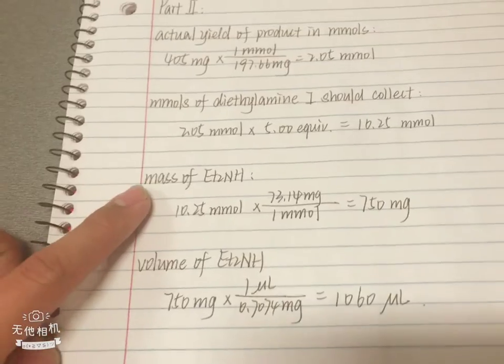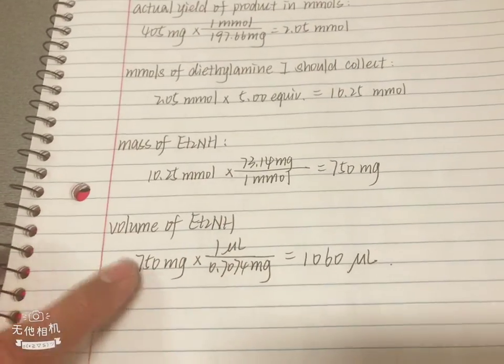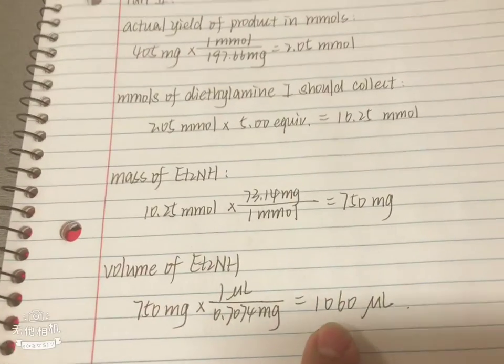Then we got a mass of it by applying the molar mass, and then we got a volume, which should be 1060 microliters. And in part 2, during the refluxing for 90 minutes, I observed a white precipitate crystallize in the reaction mixture, which most likely is diethylammonium chloride according to the textbook. After 90 minutes, I transferred the reaction mixture by pipette, away from the crystals, to a clean culture tube.